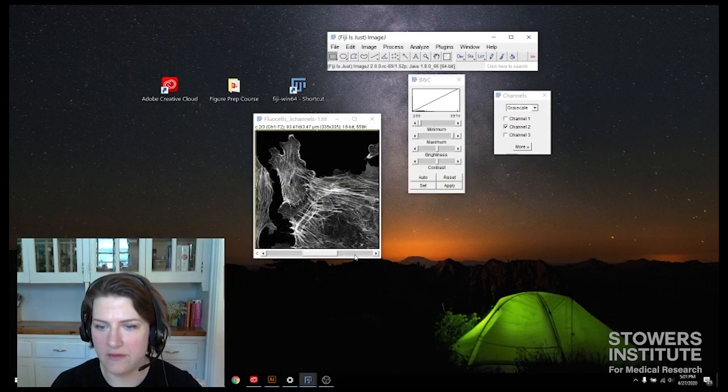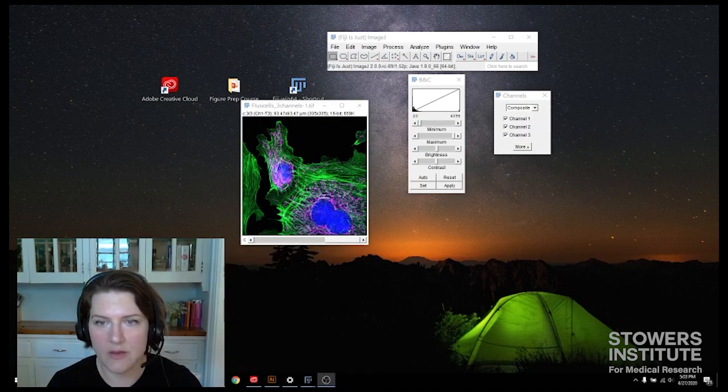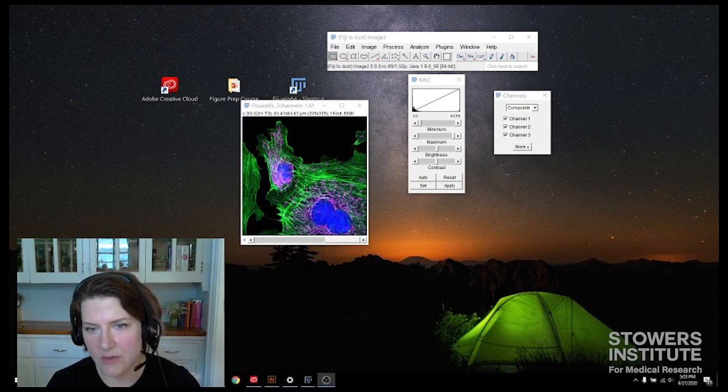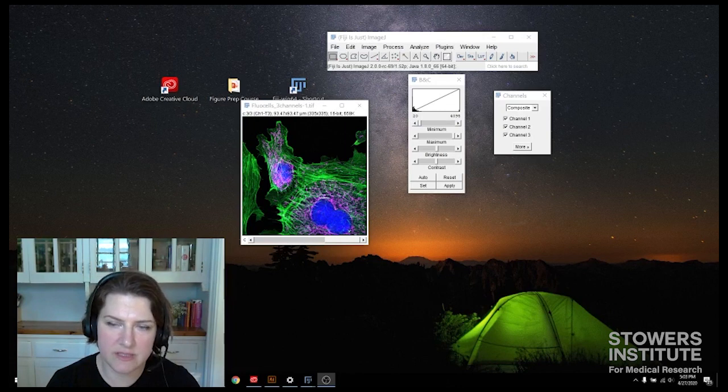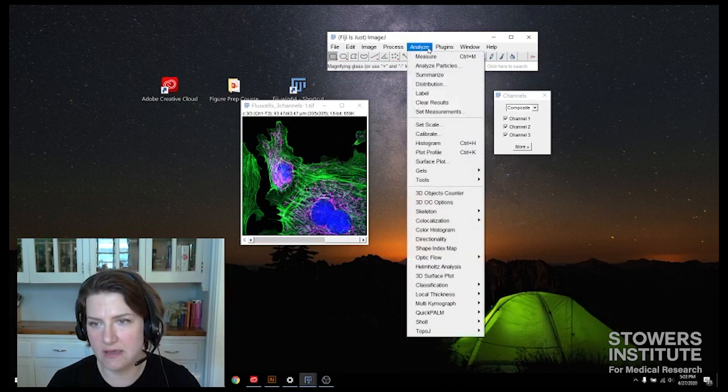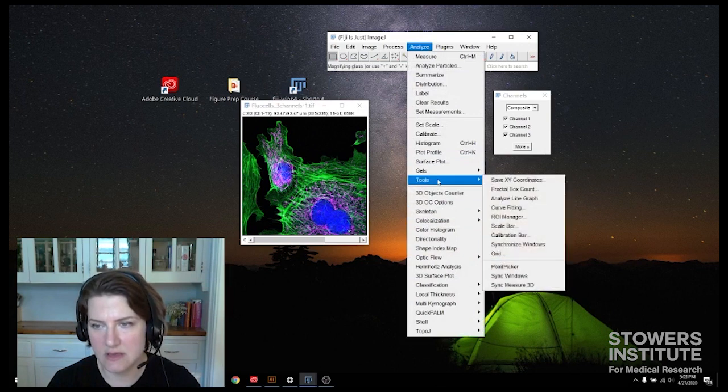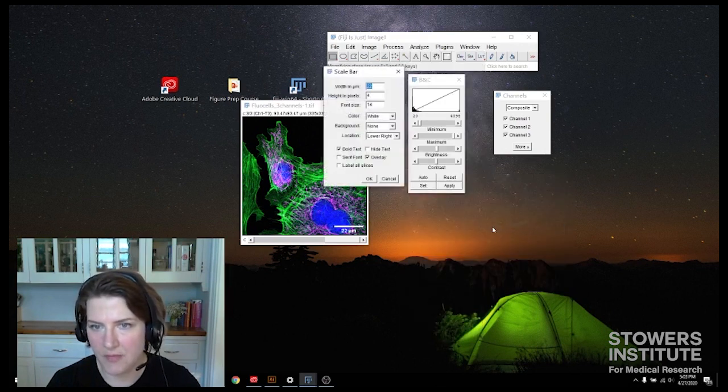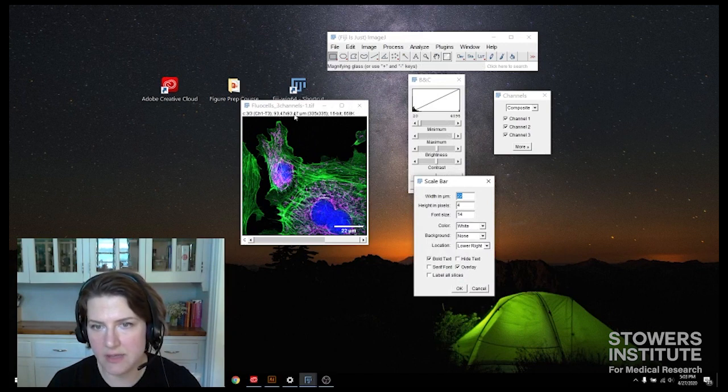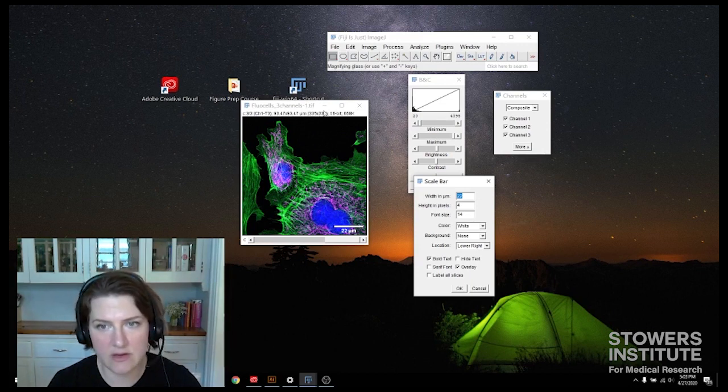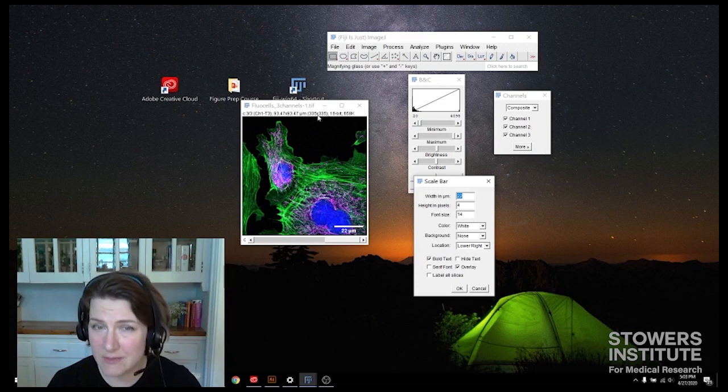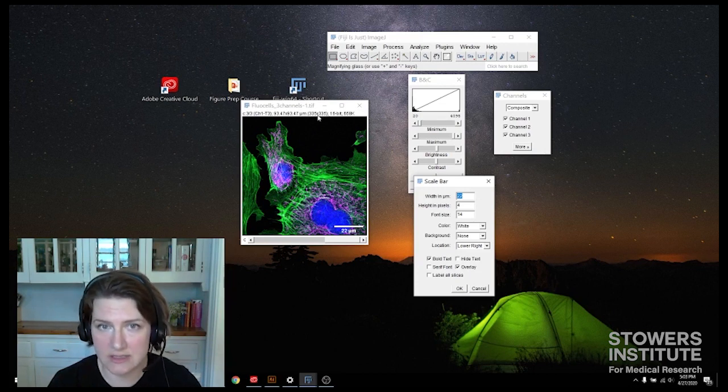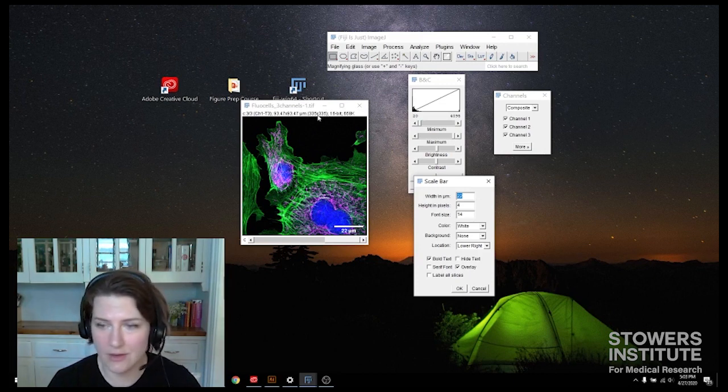And then finally, we're going to do our composite. And with our composite, we want to include a scale bar because it's always important to put a scale bar with your microscopy images in a figure. So the way to do that is to go under analyze, tools, scale bar. And you'll notice that my image already has scaling. You can see up here that it's 93 by 93 microns. But if you don't have scaling, it'll say 335 by 335 pixels. And if you don't have the image scaling in your image, you're going to need to fix that and talk to somebody in microscopy to help you.